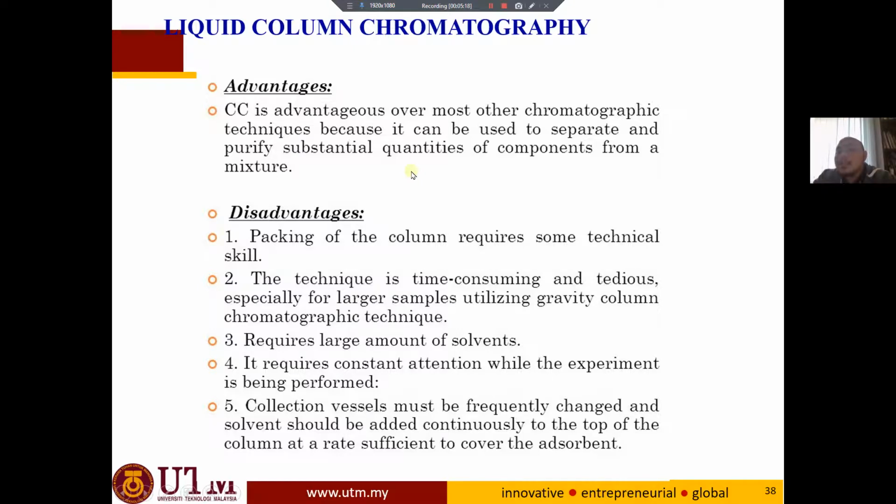So compared to the other chromatography techniques, liquid column chromatography has been used to purify compounds in large amounts. TLC is only able to show whether something is purified or not, but to purify and to collect at a higher amount, liquid column chromatography is one of the methods, other than collecting by distillation or, for example, density separation.